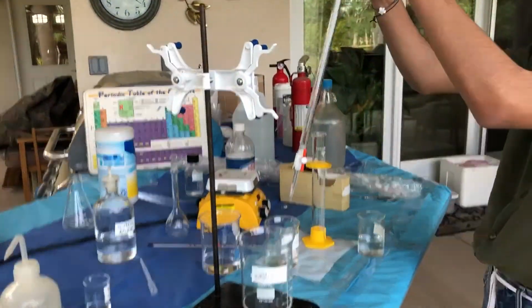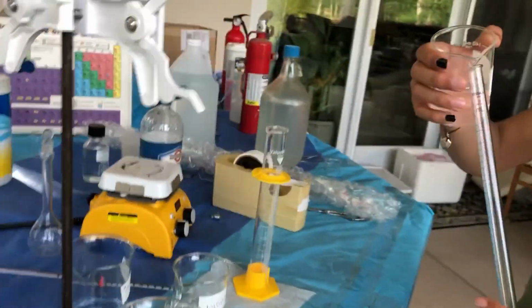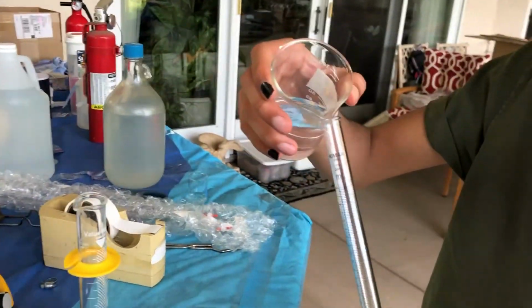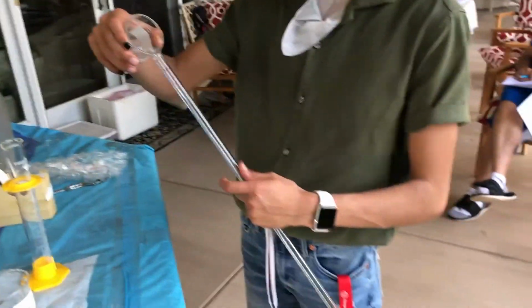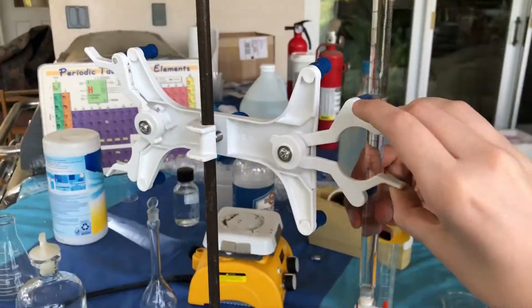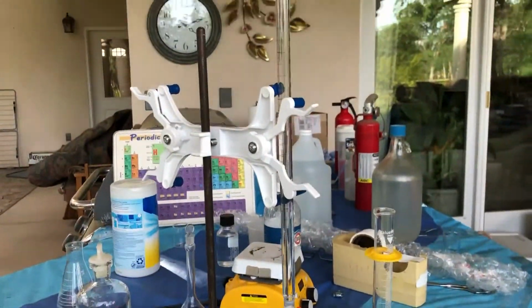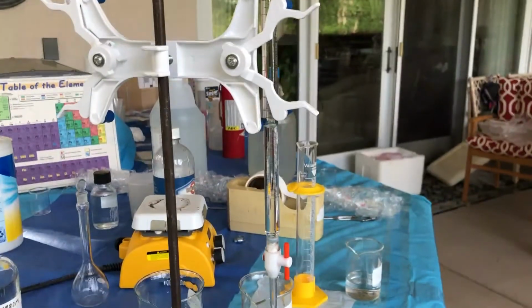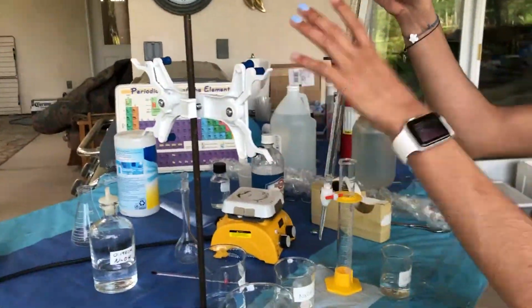So now we're going to take this, if you're vertically challenged like we are, you're going to take it off of the burette clamp. Make sure the tip is closed. You're going to rinse some more DI water through the burette, and then let that drain out again into the waste. So once all of that second DI water has run out, we're going to take a dropper.